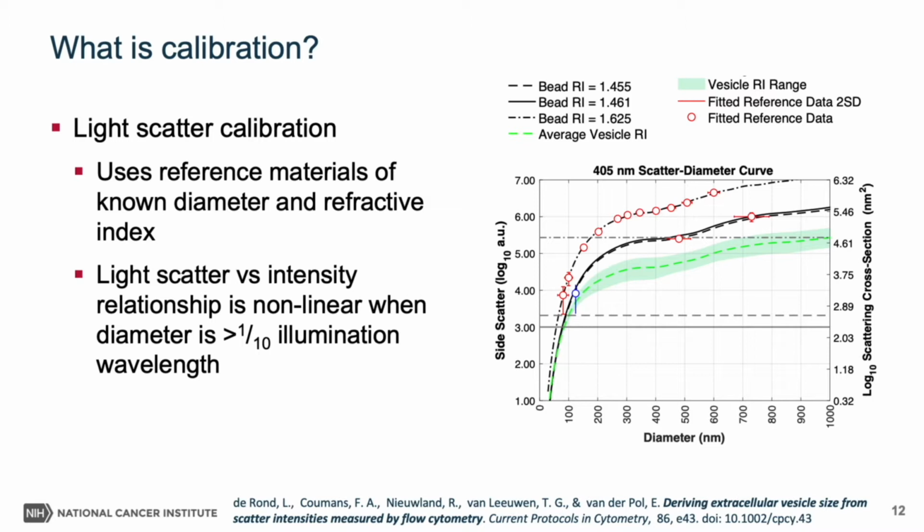So this is a more complicated parameter to calibrate when compared to fluorescence calibration, but today we'll demonstrate 2 dedicated software packages that will perform small particle light scatter calibration without needing to know the complex physics required to achieve it.